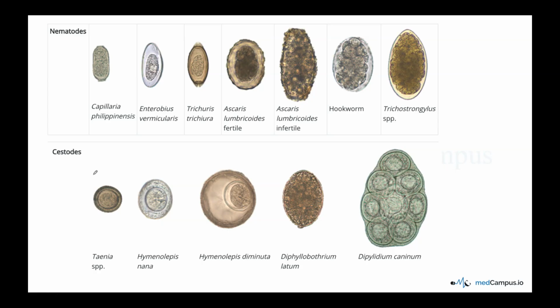It is almost 30 to 35 microns in size. And the shape here is spherical. We'll go very slow, okay? And the color is very important. Have you seen a walnut? This egg looks like a walnut color, that is walnut brown.